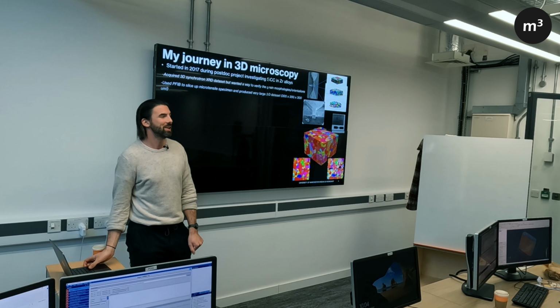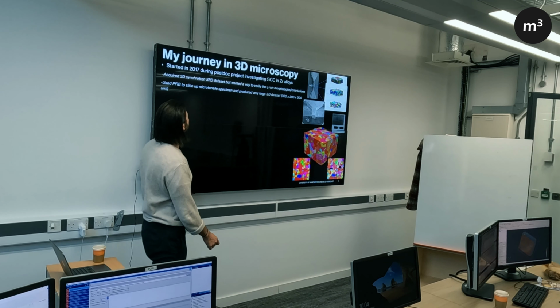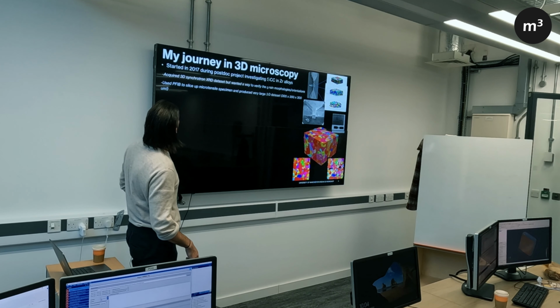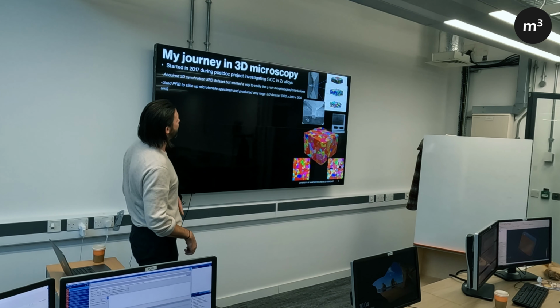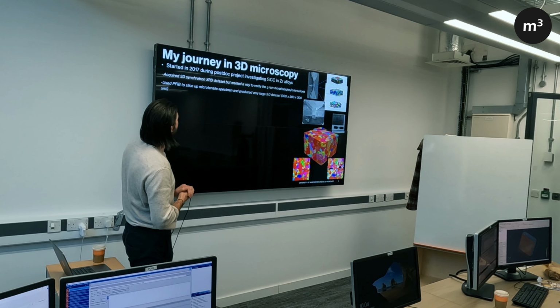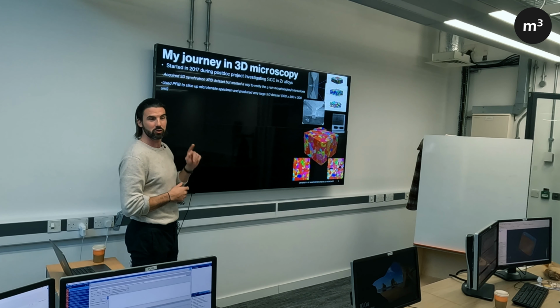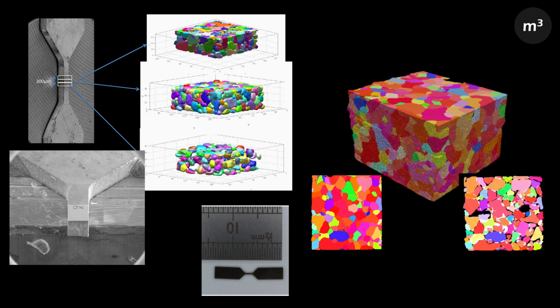My journey in 3D microscopy. I just wanted to quickly talk about why I ended up doing 3D microscopy. In 2017, I was doing a postdoc looking at SCC in zirconium alloys, and we got this really nice 3D data set from the ESRF from synchrotron diffraction contrast tomography. And the first thing I wanted to do was try it with our PFIB.